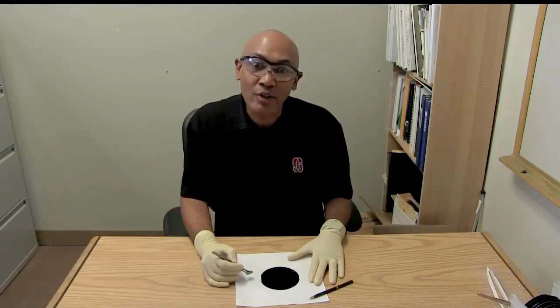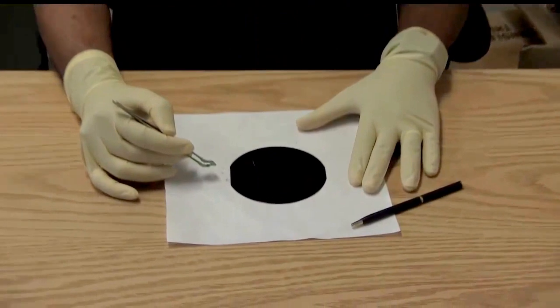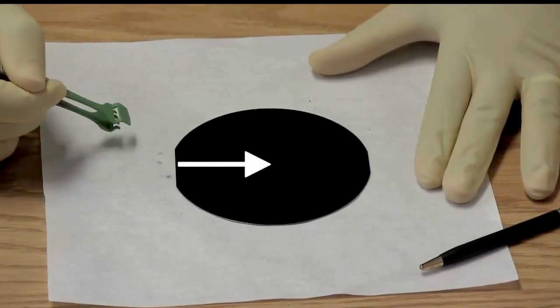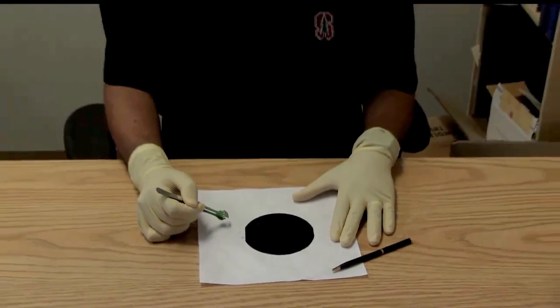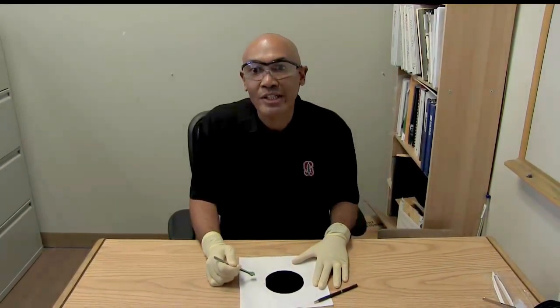If you don't do it correctly, substrates can shatter into large, irregular, and often very sharp pieces. The substrate or wafer must be oriented during the cleaving action so that the cleaving occurs down one of the main crystallographic directions. This usually means perpendicular or parallel to the flat of the wafer, or perpendicular to a side of a rectangular substrate. Once a fracture is initiated at the edge in the right direction, the whole substrate will break in two in a straight line.